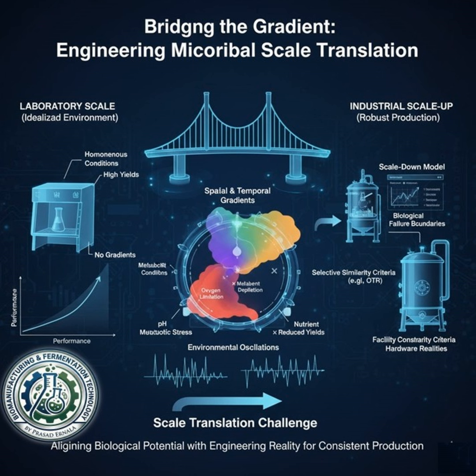Your yield just plummets. There's a perfect example of this in the source material with Bacillus licheniformis, the workhorse for making industrial enzymes. A classic case. In the lab, in a 5-liter vessel, everything's uniform. You get great yields, over 10 grams per liter of protease. But then you go big, 50,000, maybe 100,000 liters. And the physics takes over. Mixing times jump from milliseconds to maybe 30, even 60 seconds. And that creates these huge vertical DO gradients that swing from, say, 50% saturation at the top to basically zero at the bottom. So the cell is on a 60-second roller coaster ride from feast to famine. Precisely.